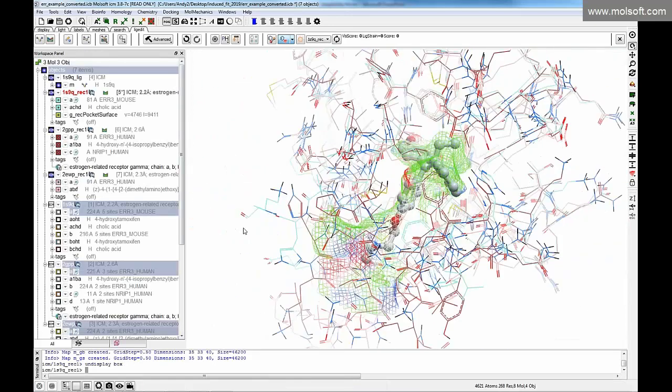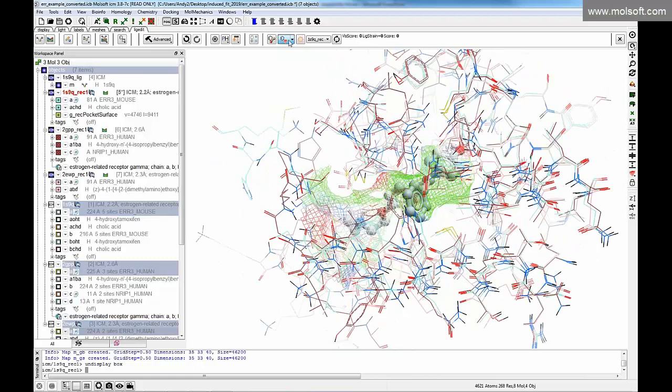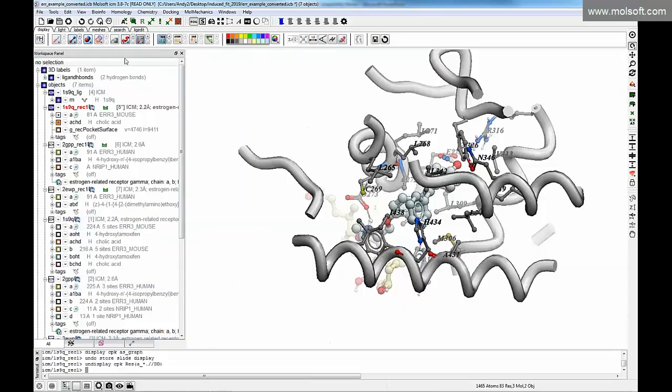Okay, and then you get something like this. So this is basically, I was going to change it to pretty view, but sorry.